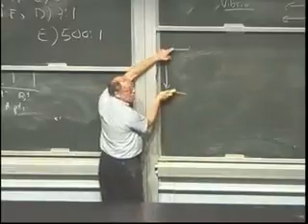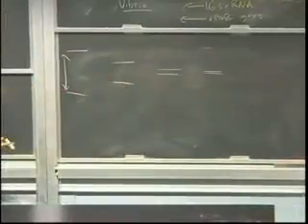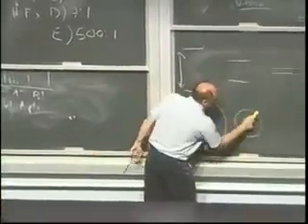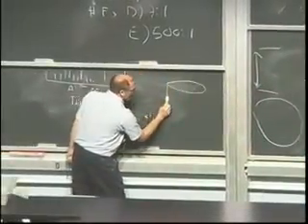So for a low power, we have a big depth of focus. For a higher power, the depth of focus is decreasing. For an even higher power, even smaller depth of focus, and even higher, less. So what we see in focus is getting smaller and smaller. Okay? The field of view, which is the circle, the image, where the specimen is, is also decreasing. So here, the field of view is big, and as we increase the magnification, the field of view gets smaller and smaller. So the cylinder that we see is getting smaller and smaller. Cylinder, because it's a circle with a depth of focus in this direction.